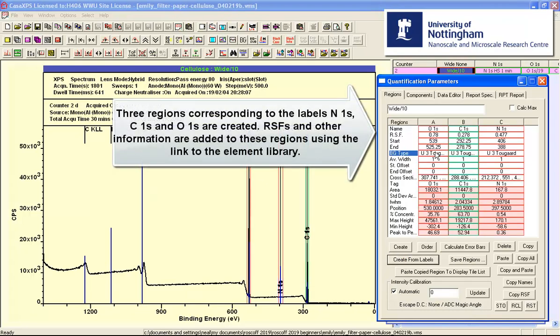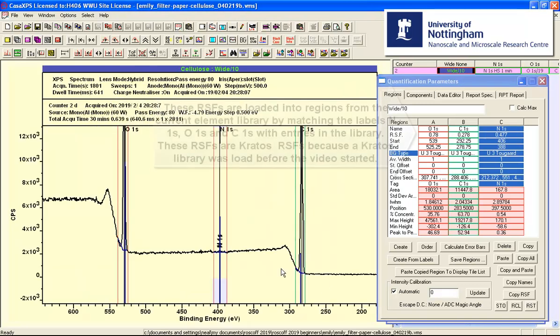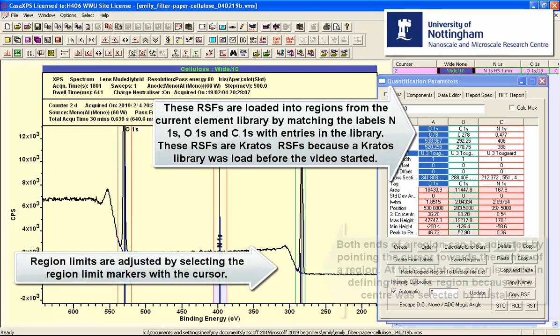So we end up with relative sensitivity factors that are brought in from the element library and a set of regions that correspond to the peaks. So we can just adjust these a little bit, perhaps.